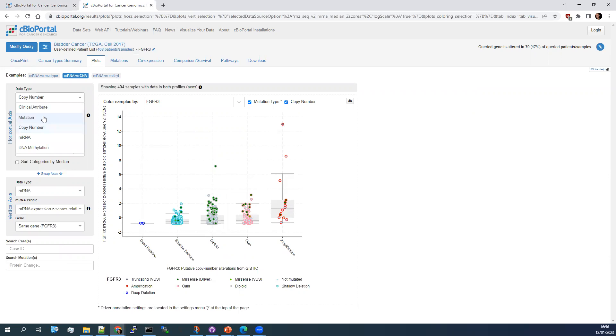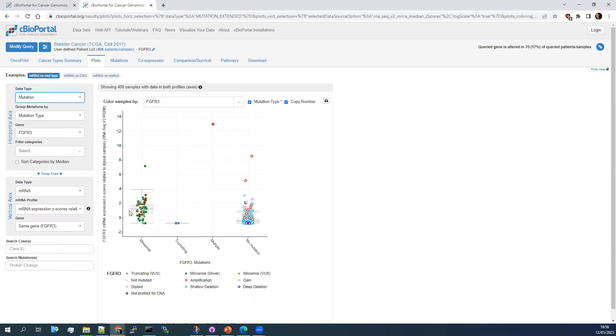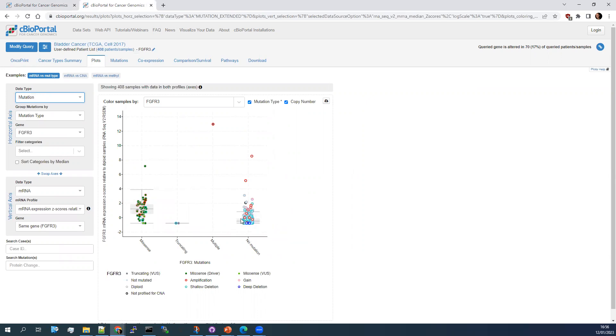You can see here that amplified FGFR3 has higher expression, as you would probably expect, and that deep deletions have lower expression. Change up here, go into mutations, and you can see again that the missense mutations have, on average, a higher level of expression than those with no mutation at all. So you can start getting a feel for your data on whether or not a mutation is actually having an effect in your samples.